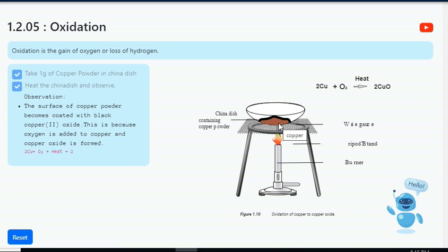2Cu + O₂ + heat gives 2CuO. Select the next checkbox to add the lid over the china dish.